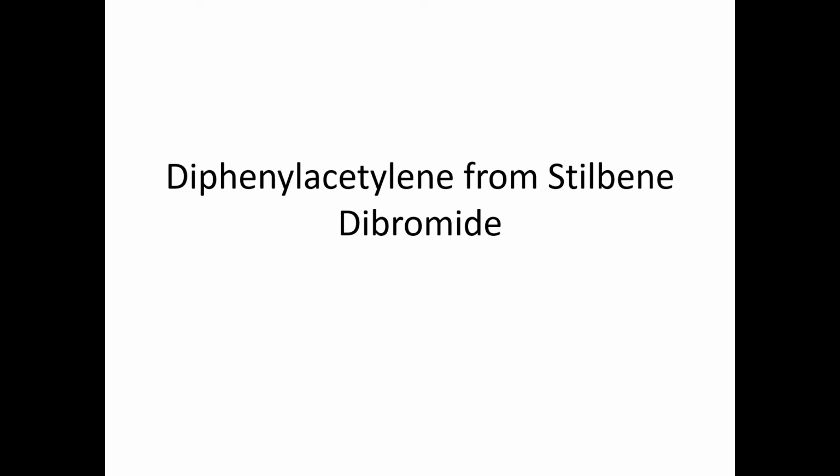Welcome back, everyone. So today I'm going to be talking about the conversion of stilbene dibromide to diphenylacetylene.